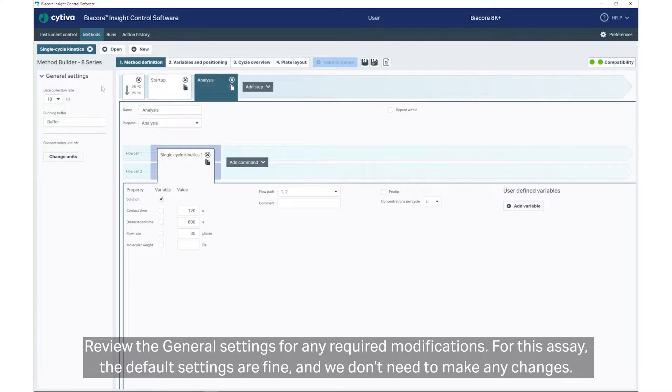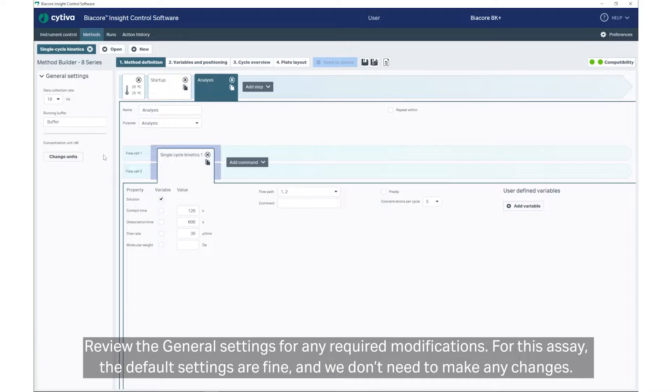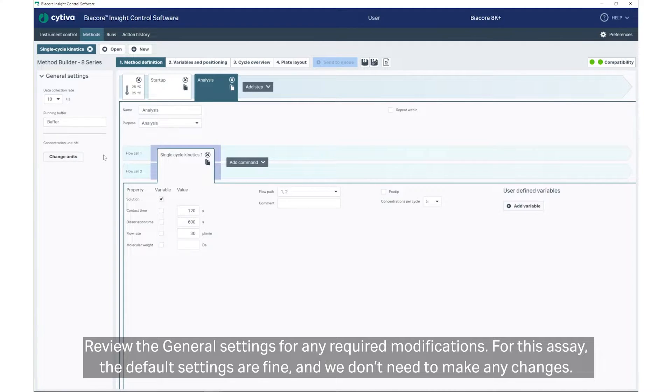Review the general settings for any required modifications. For this assay, the default settings are fine and we don't need to make any changes.